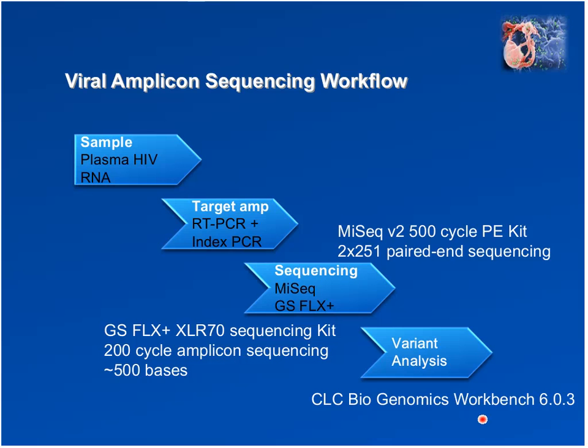In either case, the CLC Genomics Workbench will allow you to do the alignments you need to do and move directly to calling variants by base quality, so by variant quality. And then the resulting variants are added. What is added to that table is a list of the non-synonymous amino acid changes.